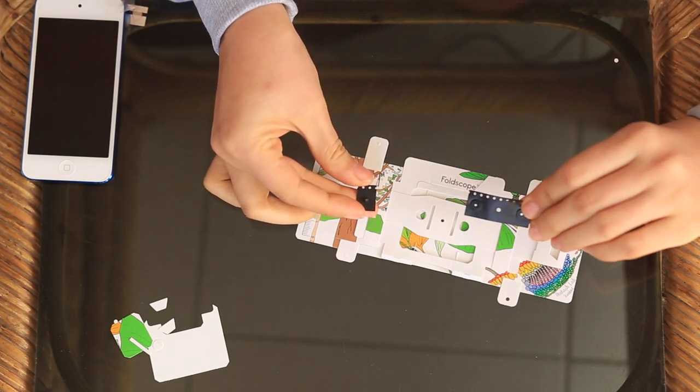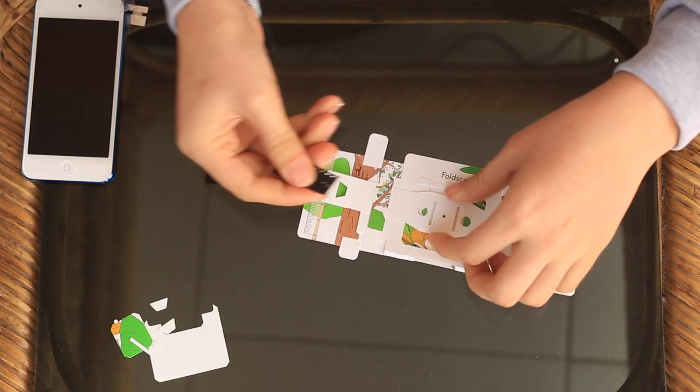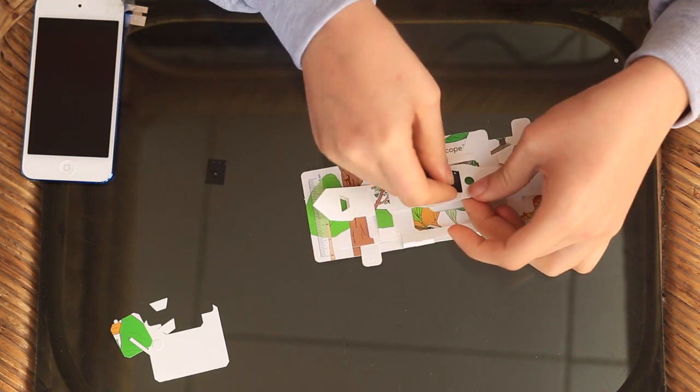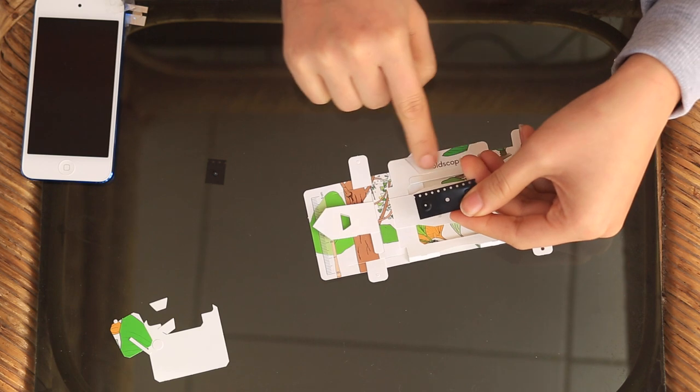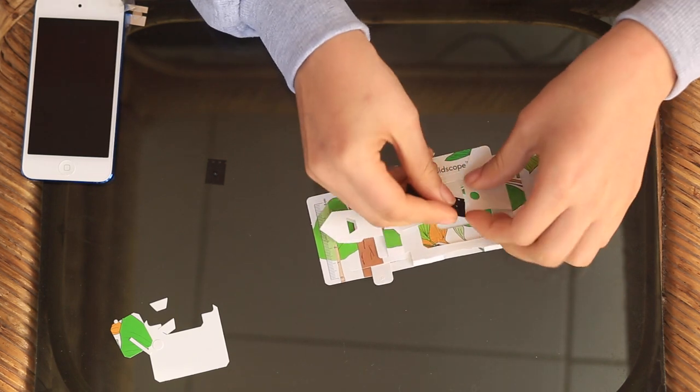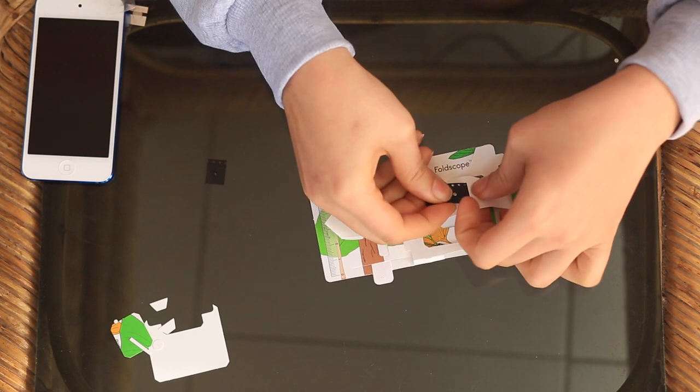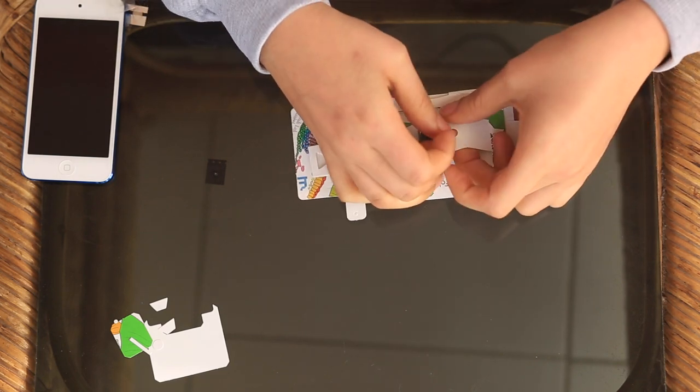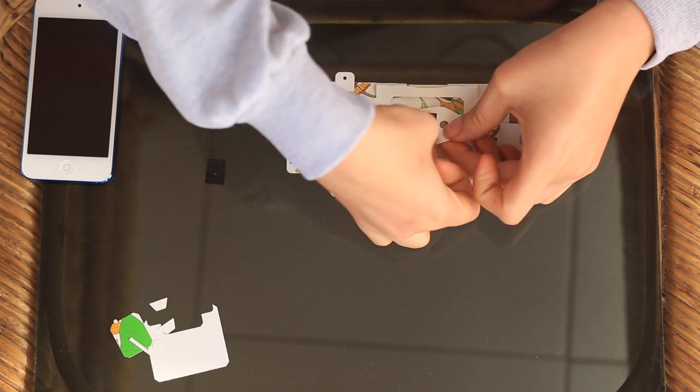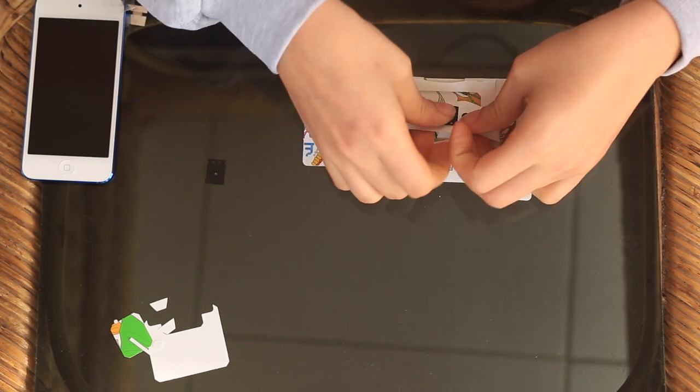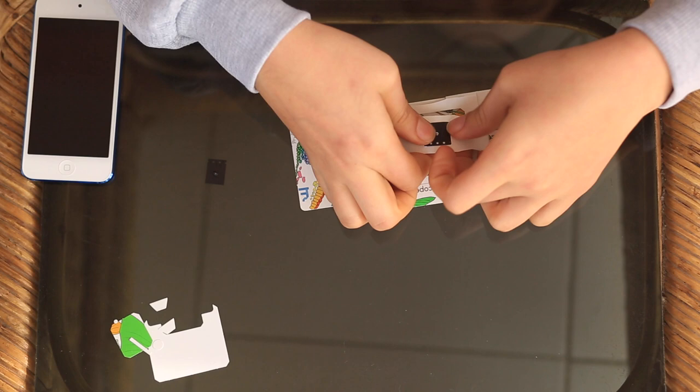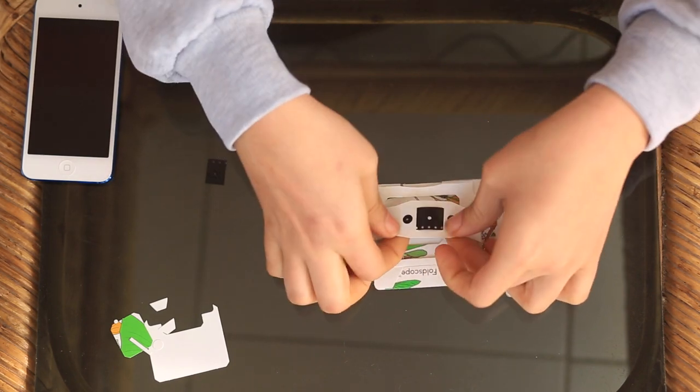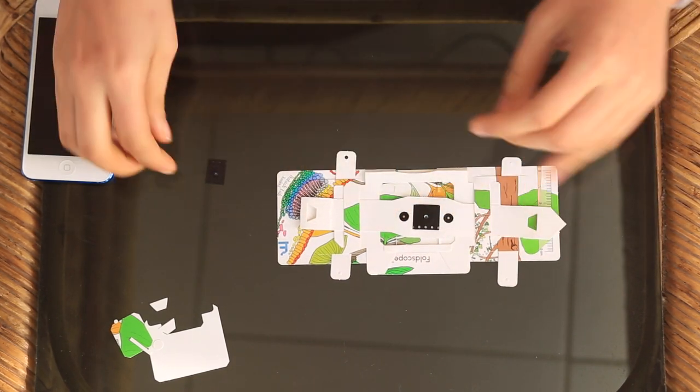So these two parts are what makes it into a Foldscope. So first you take the magnetic coupler and you want to make sure the line of holes lines up with the Foldscope logo. So you put it through here and then also under here. So now that those holes line up there, compress them into place.